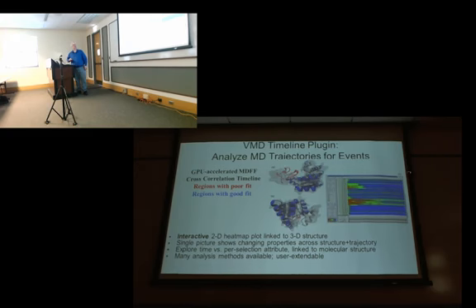This is the structure vertically at different residues, and this is the simulated time in the MDFF simulation. We can see the red regions basically starting to go green and then finally to blue towards the end. And that at the end, we've got a good quality of fit with just one little troublesome area right there that's left for somebody to pore over and fix.